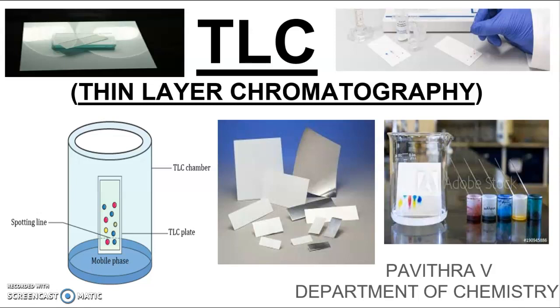The spot differentiates when the solvent moves upwards. This is the TLC plate, which you can cut into whatever shape you want, whatever length or width you want. And this is the TLC chamber. After the TLC is completed, it looks like this.